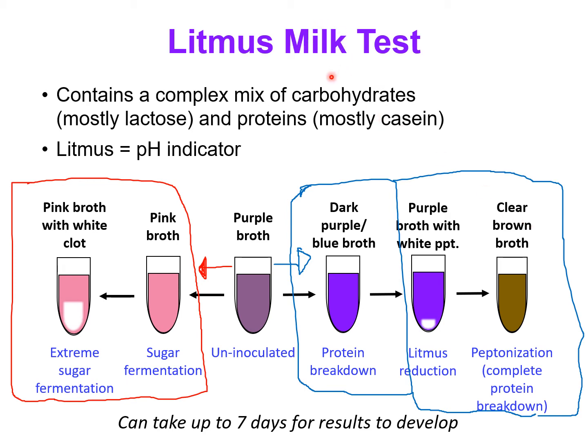You guys, meaning that it's kind of like opaque, right? And the reason why it's opaque is because of all of that protein milk has, okay?